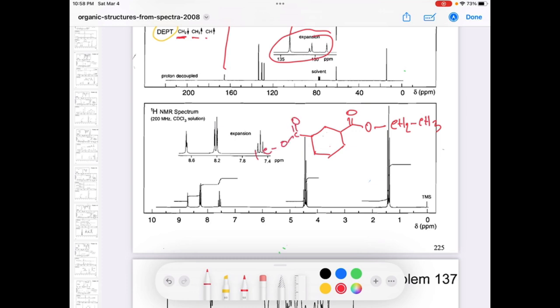And in the aromatic ring pattern signal, you can get some idea if we put hydrogens here, HA, HB, and this is also the same and this is the same. So A will be a triplet, and B will be a doublet of doublet, because B can see A, so it will give you a doublet.